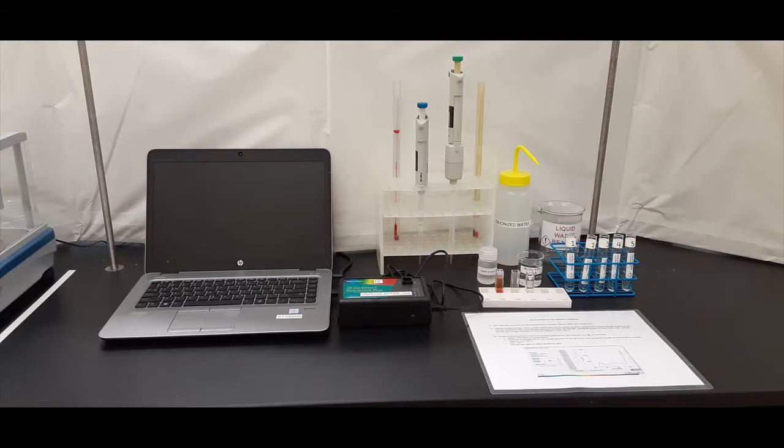Let's start by taking a look at our lab setup. You've seen all of this before: the computer, the spectrometer, the cuvettes, test tubes, a liquid waste container, a small bottle of reagent, a beaker for water, and a 1 and a 5 milliliter pipette.